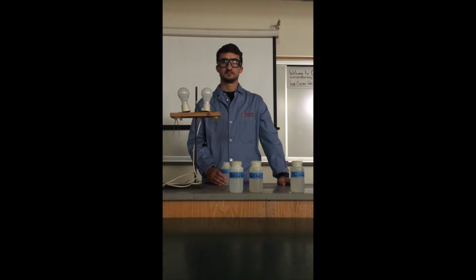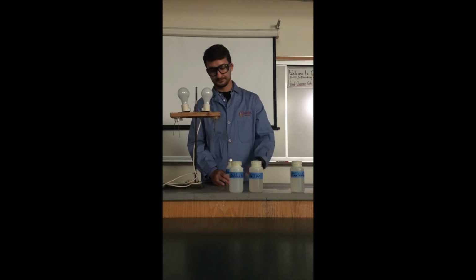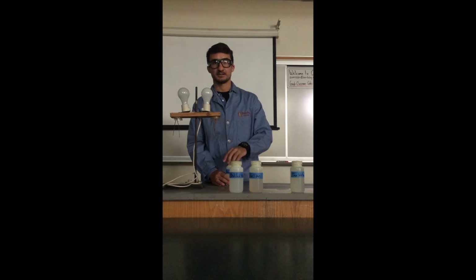Here we go. This is our sugar water solution. 1, 2, 3. Nothing. Does not conduct.